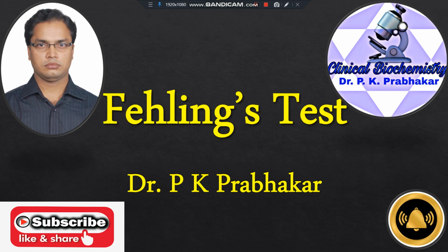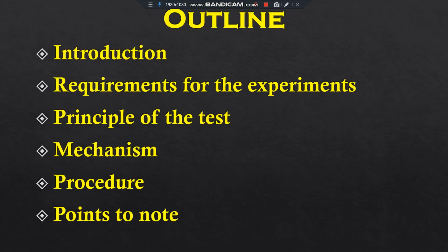Today we are going to discuss the Fehling test. Our lecture will cover the introduction of the test, what we require during the experiment, the principle of the test and how the reaction occurs, the procedure, and then some important points to remember.